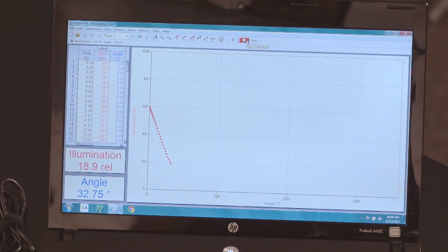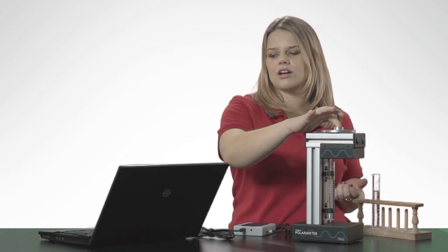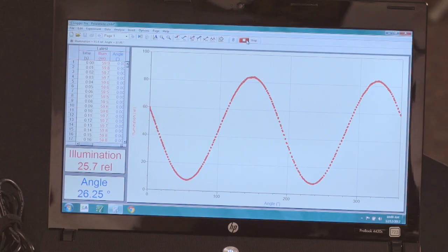After I've done that, I begin to rotate the analyzer, and a cosine squared waveform should appear on the screen.